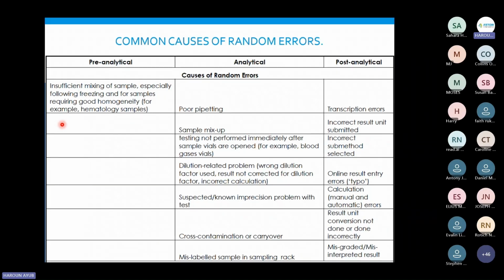So this distilled water, do you also subject it to tests? Or is it just that the distributor that was given that particular role by maybe your lab manager or the director or the procurement is just selling you the distilled water? Have you tested that particular water as a laboratory, or have you asked for that report from the distributor? You need to be very keen on that particular sample reconstitution process and what you are using.